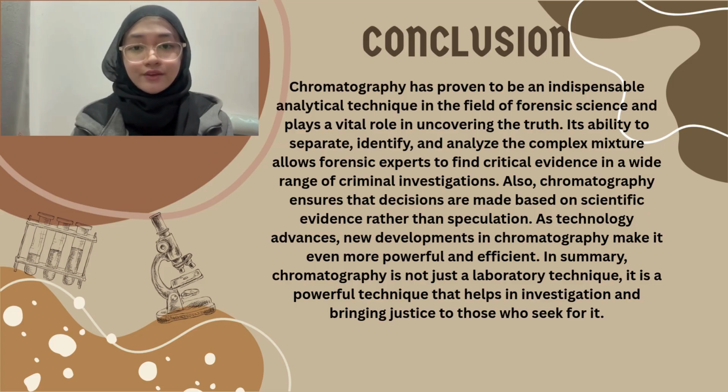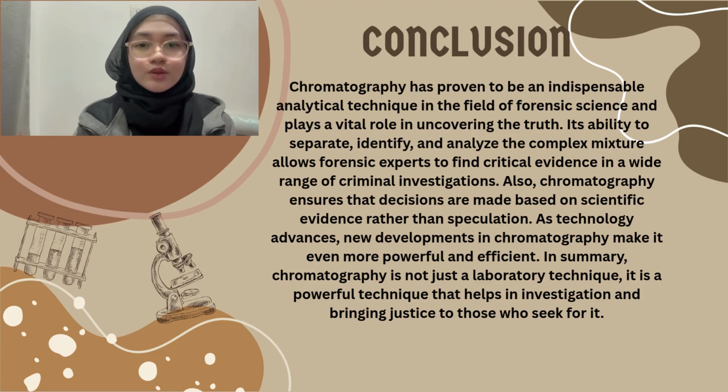As technology advances, new developments in chromatography make it even more powerful and efficient. In summary, chromatography is not just a laboratory technique, it is a powerful tool that helps in investigation and bringing justice to those who seek it.